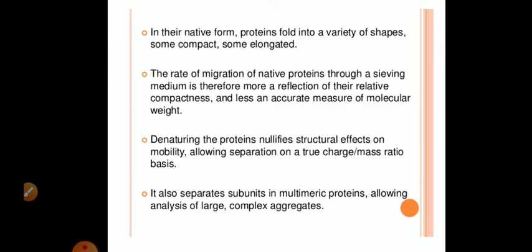Next in the series of solubilizers is beta mercaptoethanol. Beta mercaptoethanol is required to break disulfide linkages. Beta mercaptoethanol treatment is followed by iodoacetate treatment so that the separated subunits do not reassociate.